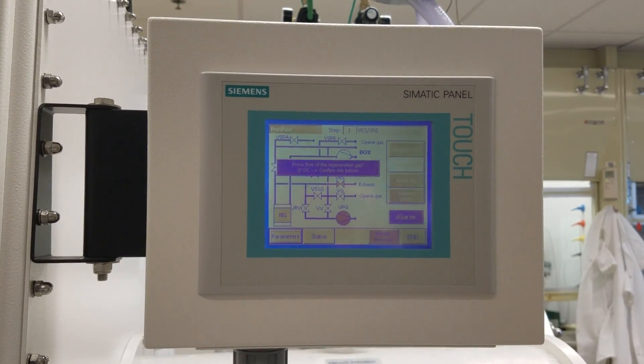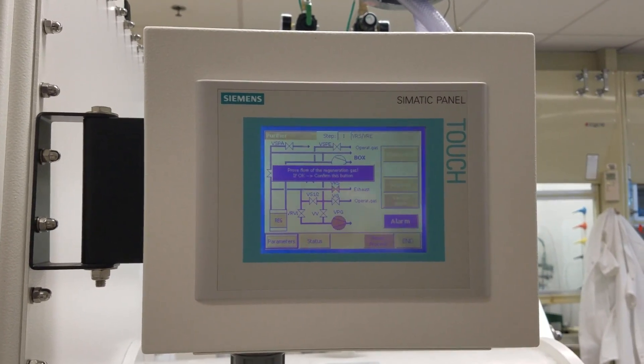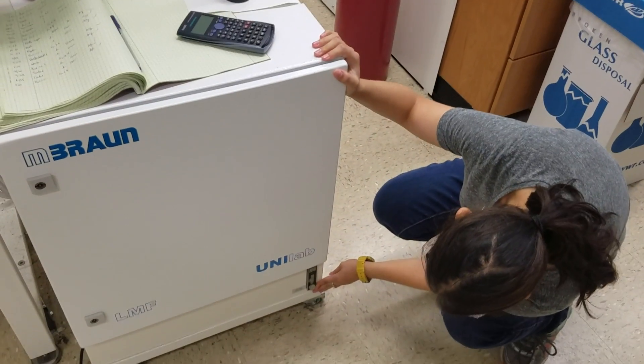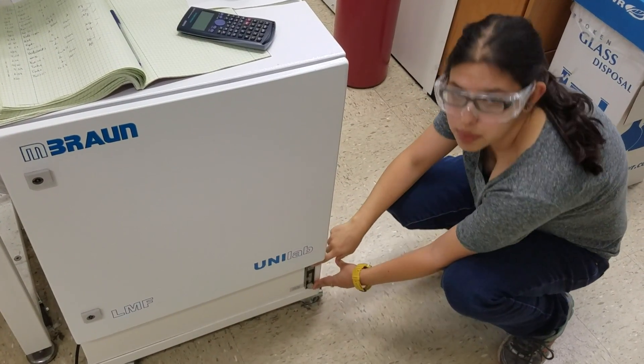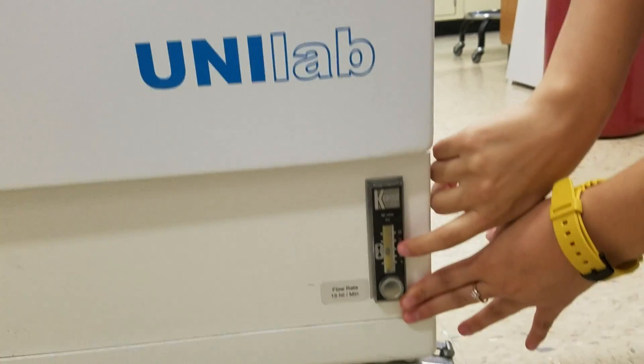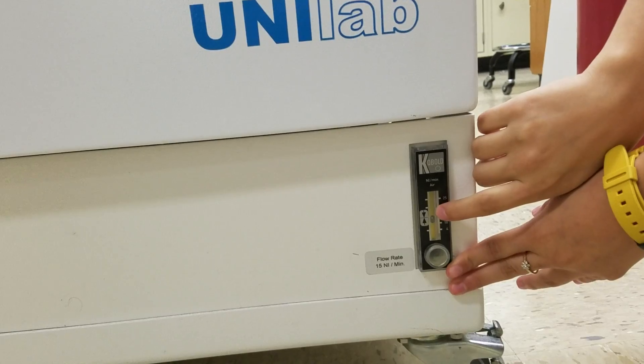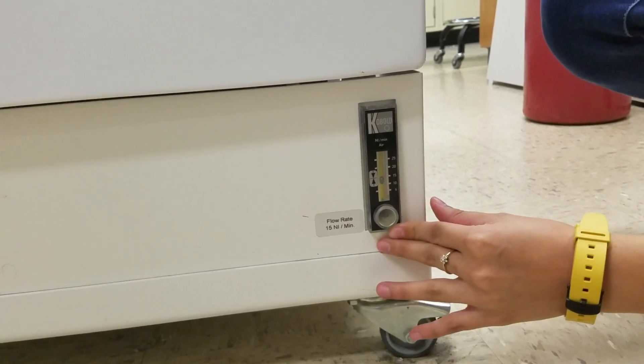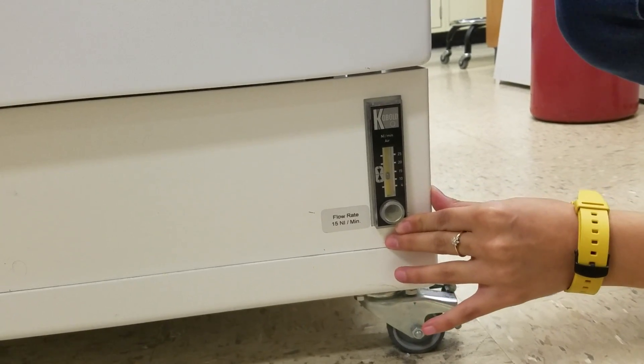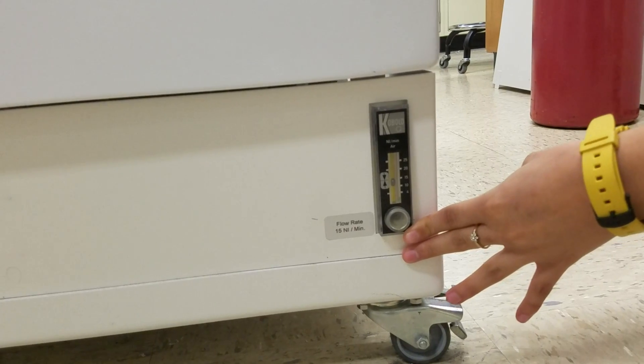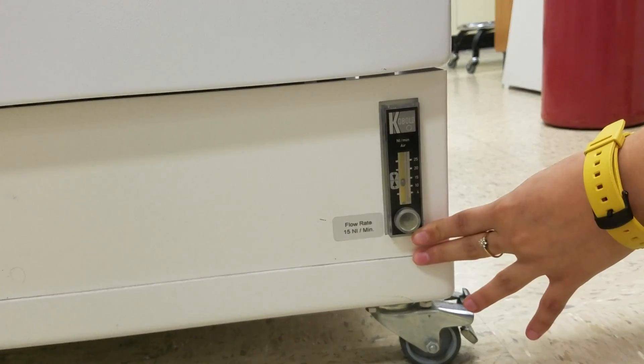Okay, so in our case, we want to do this, so we have to confirm the regeneration gas flow, and we do that by going down here and looking at this flow meter right down here, and it indicates to you where the ideal gas flow is in between these two lines, this is just the lead bead that's in there, and right now, the flow rate looks pretty good. The bead is in the center, and it's being pretty consistent over time.